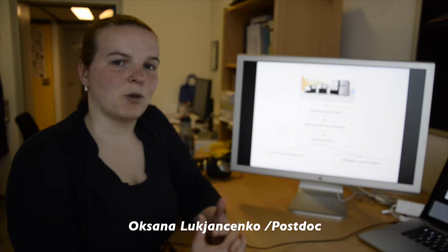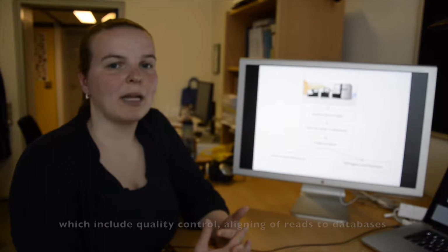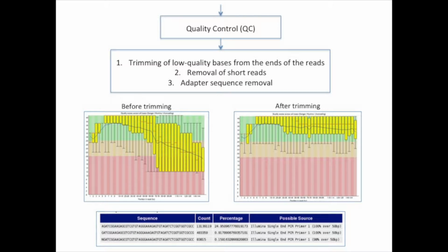After we get raw sequences from the sequencer, they have to go through certain steps of a pipeline, which include quality control, aligning of reads to the databases, and further analysis of the output files. The quality control step includes the removal of adapter sequences, trimming of low quality bases from the end of the reads, and further removal of short read sequences.